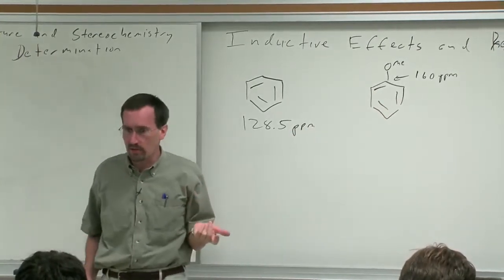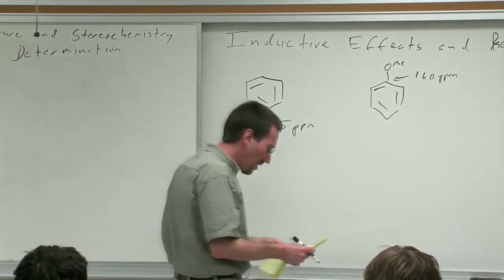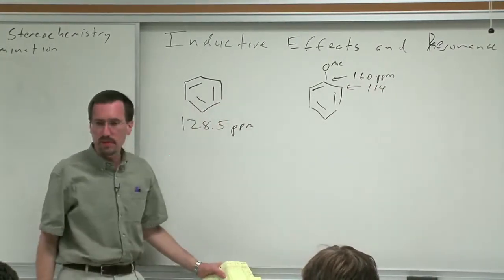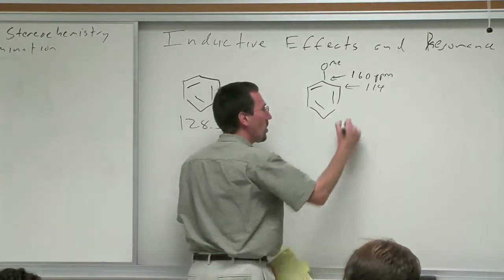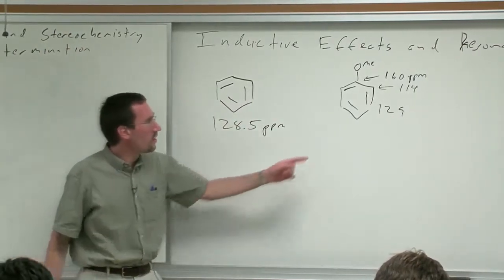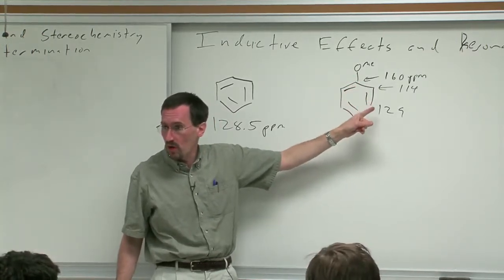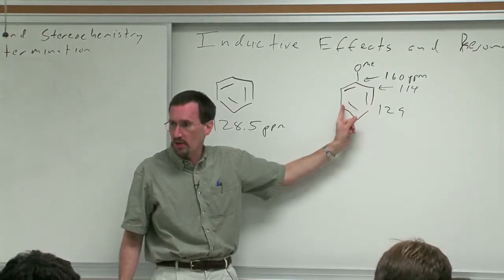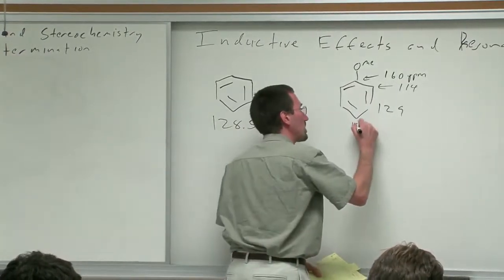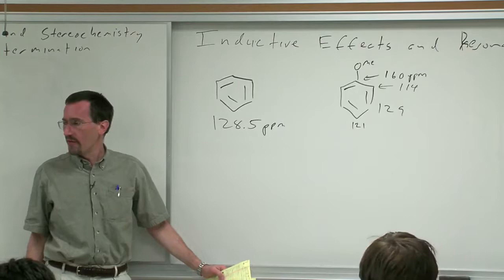It's the same reason why electrophilic aromatic substitution occurs ortho and para when you have a methoxy group on there. So the ortho carbons appear at 114 ppm in methoxybenzene. You don't get a big effect at the meta carbons, which makes sense because the inductive effects are now quite removed, so it's very small, and resonance doesn't pump up the electron density at the meta carbon. You go to the para carbon, and now you also see an upfield shifting, albeit a smaller upfield shifting, of 121 ppm.